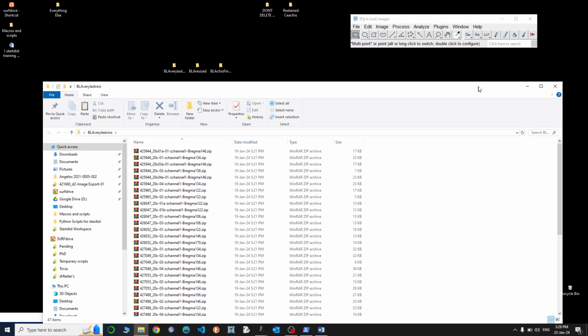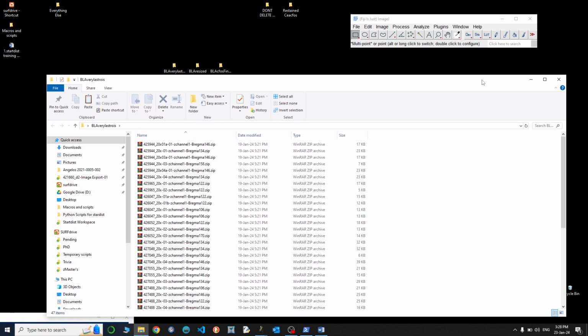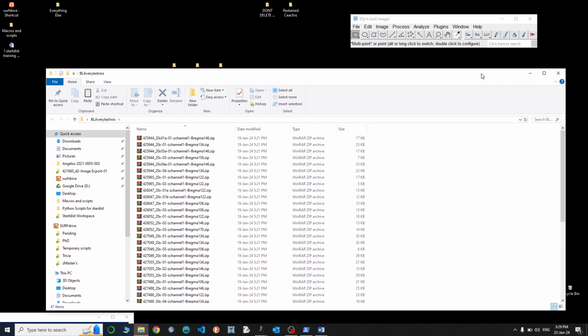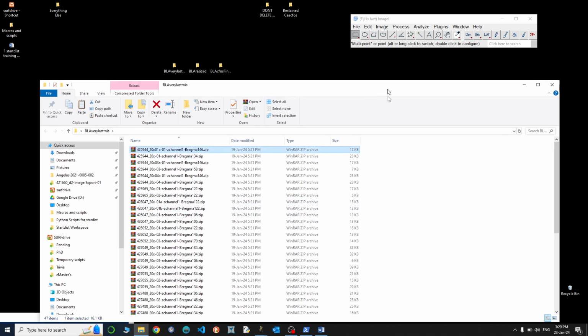At least that's what happens when you go for the blinded option in step 19a. This might differ a bit, and maybe you won't have to change anything, but at least based on the way I update my data and based on the codes that I've run, I get an output like this. It's fine. You can still change it.